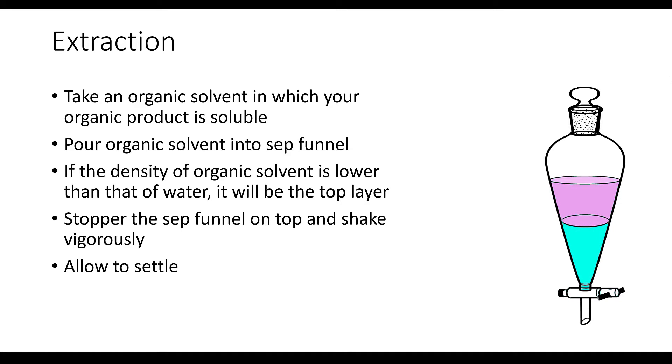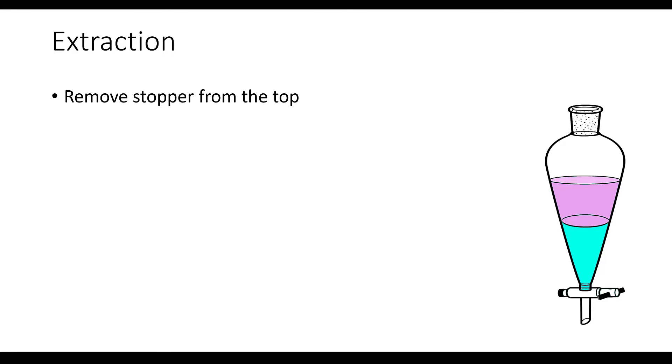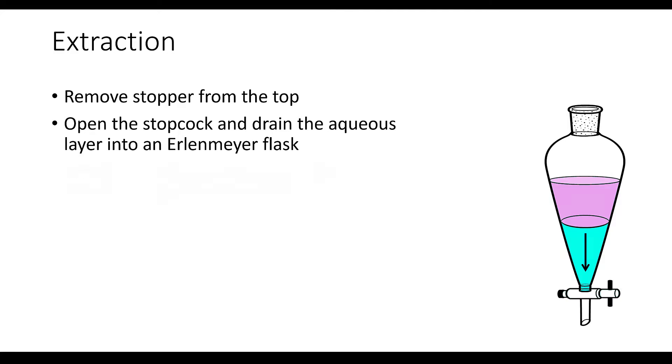Now the top organic layer should contain our organic product. Remove the stopper from the top, put an Erlenmeyer flask underneath the nozzle of the funnel, and open up the stopcock to allow the aqueous layer to flow into the Erlenmeyer flask. When the organic layer approaches the stopcock, promptly close it so that you don't lose any of your organic solution into the aqueous flask. At this point, if your organic layer is still contaminated with inorganic material, you could continue washing it by doing another extraction with a fresh batch of water.